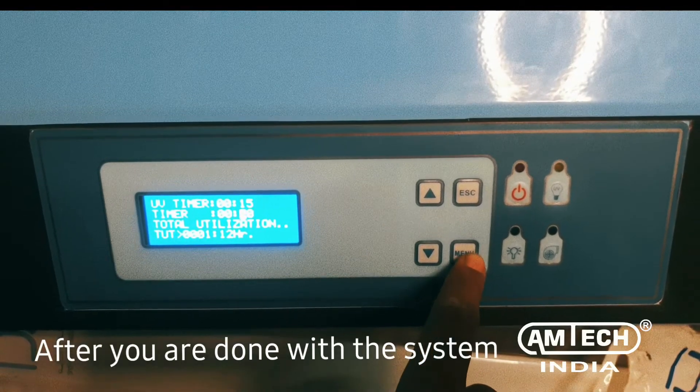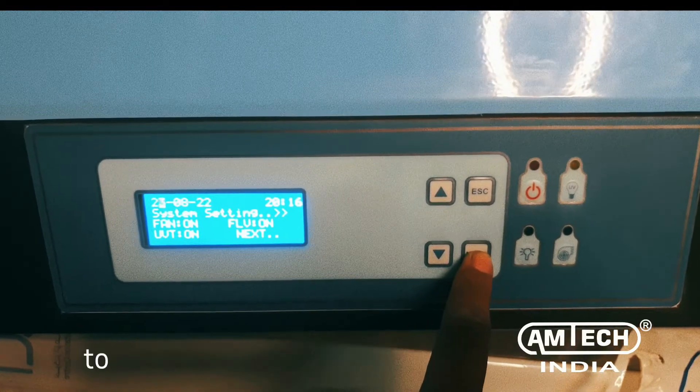After you are done with the system configuration, press the ESC button to exit configuration.